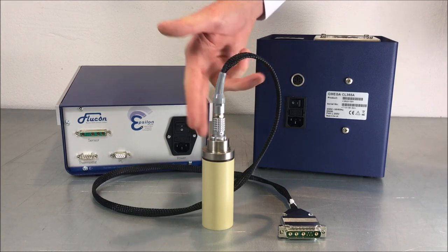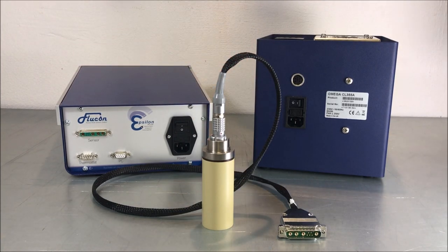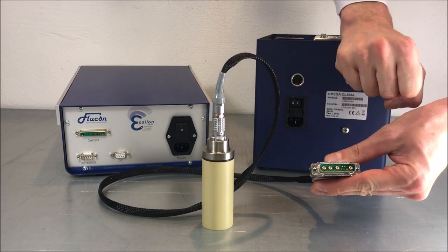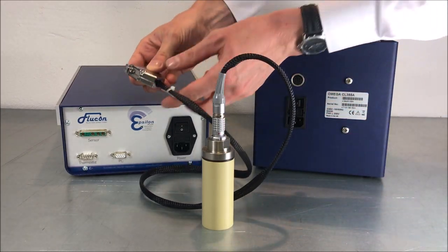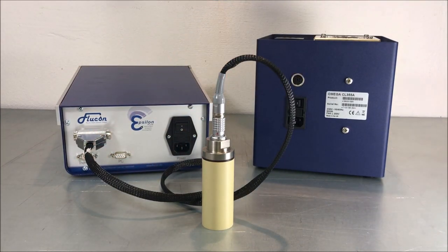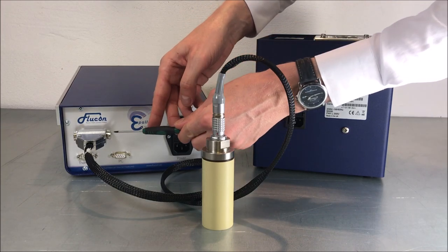In order to connect the sensor to the Epsilon Plus device, plug in the large plug into the sensor socket with its wider side up. Use the additional screws to tighten the connection.